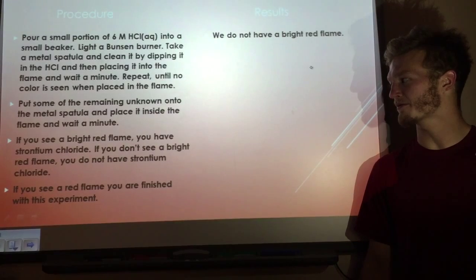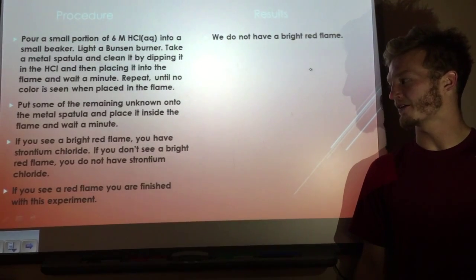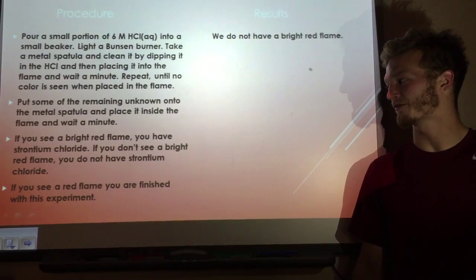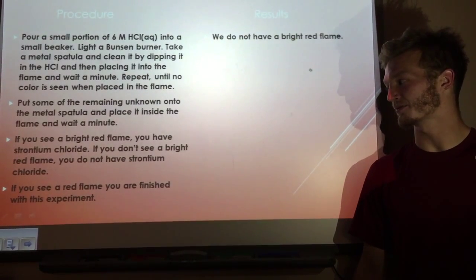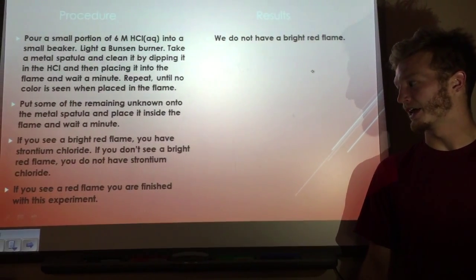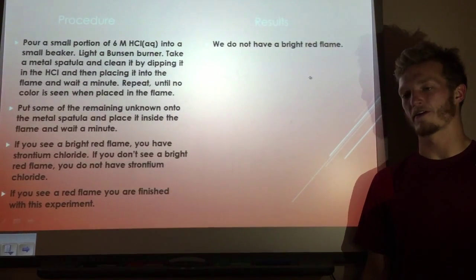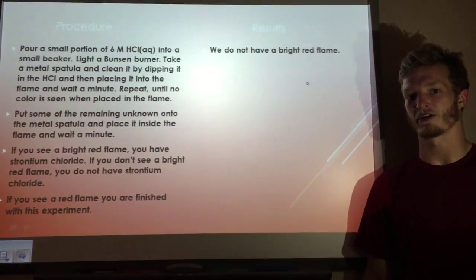If you see a red bright flame, you have strontium chloride. If you do not see a bright red flame, you do not have strontium chloride. And if you see a red flame, then you are finished with the experiment. We did not see a red bright flame.